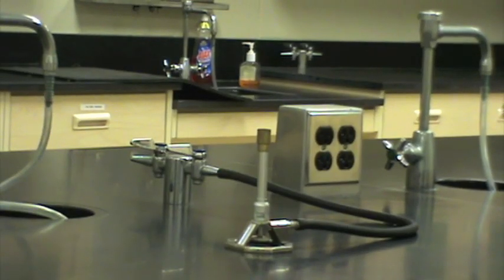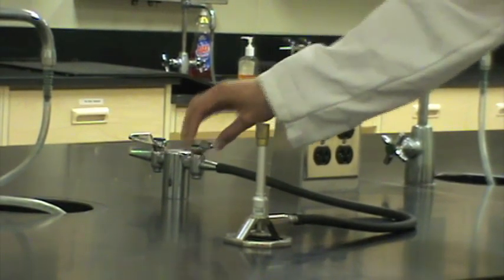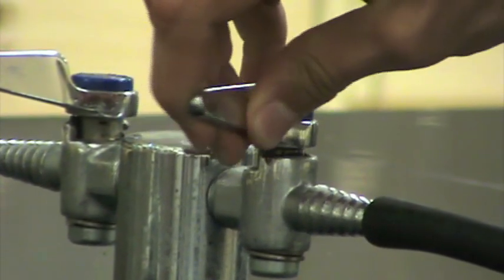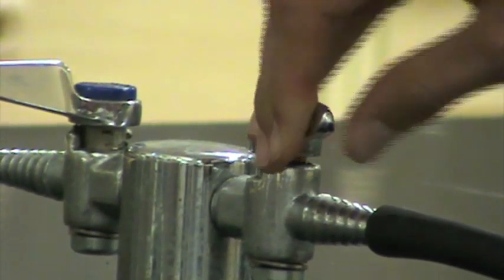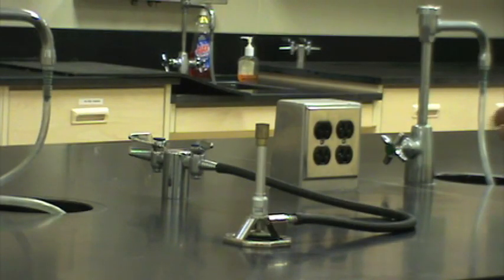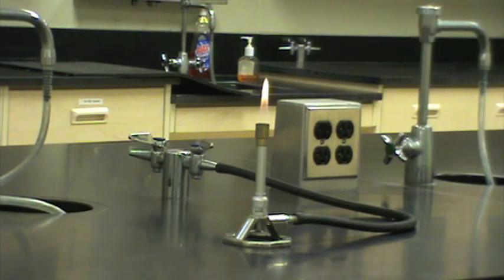We use strikers to light Bunsen burners in our lab, but I know many places use matches, so we're going to show you both techniques. With the striker, you will need to turn the gas on first. You don't want the gas to be on all the way, but it does need to be on high enough for the burner to light. I find about 3/4 of the way is about right. Hold your striker directly above the burner and squeeze. It might take you a little practice to get competent using the striker, but eventually you will get the hang of it.